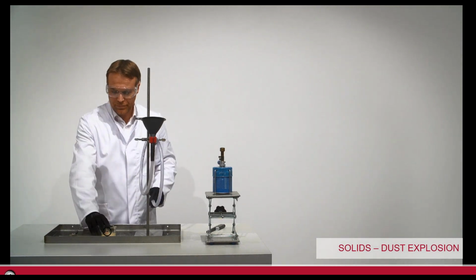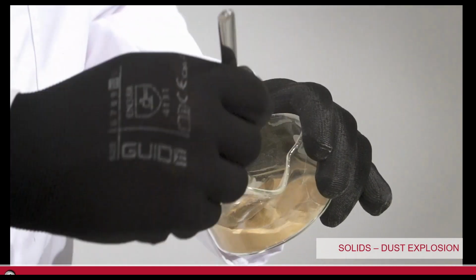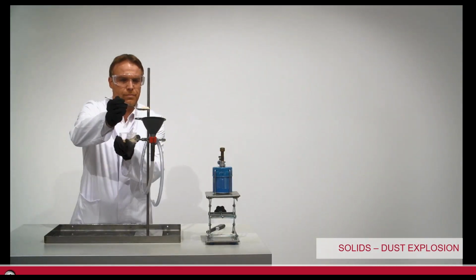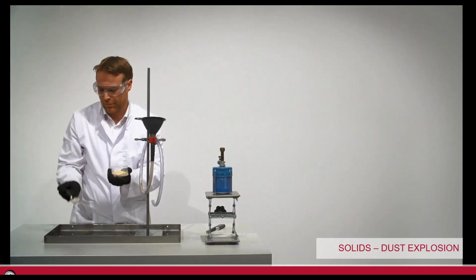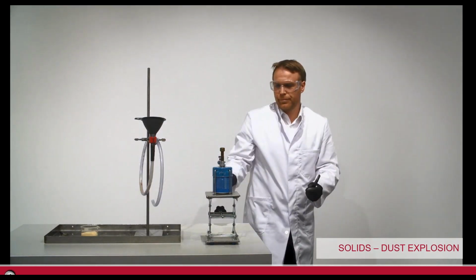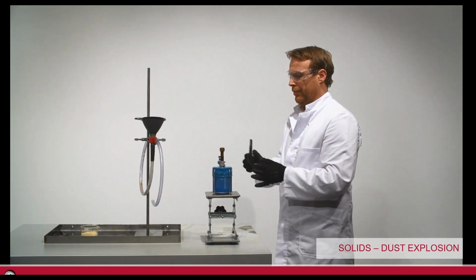But grain dust was a big thing that always popped in my mind as far as an explosive solid. But there's a lot of chemicals used in laboratory space as well. Dominic's going to just create a little fun out of some lycopod spores here. This is one I would not do if I was there with you. I don't know how to control this one. It's kind of interesting what can happen. Watch a solid turn into an aerosol can's worth of explosions or fires. So understanding what our clients are using, understanding how to store them, teaching them how to store them and segregate them per your design. That's the goal.